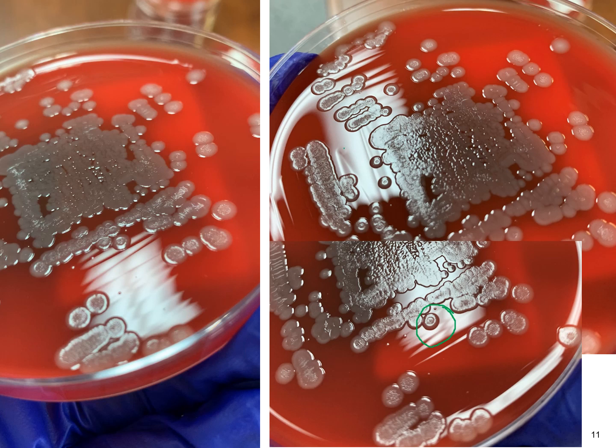And so a lot of them are doing it where you kind of have the raised edges and then it kind of pits back down inside of itself. But the inside of these colonies look a little rough. And so this is kind of a unique look that you don't see very often.